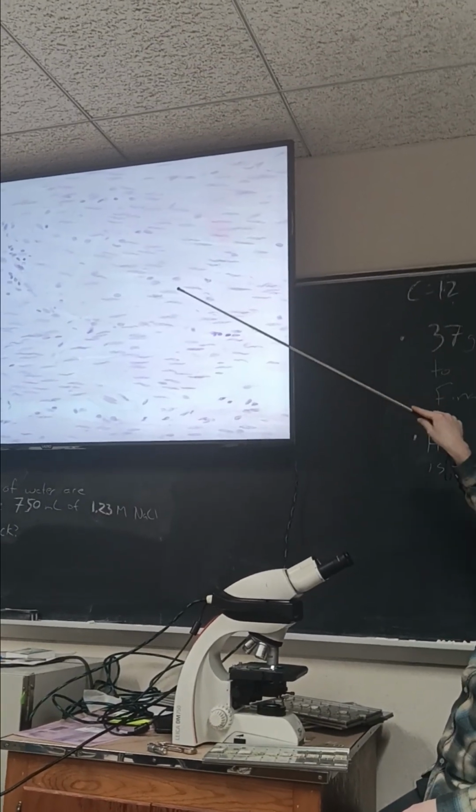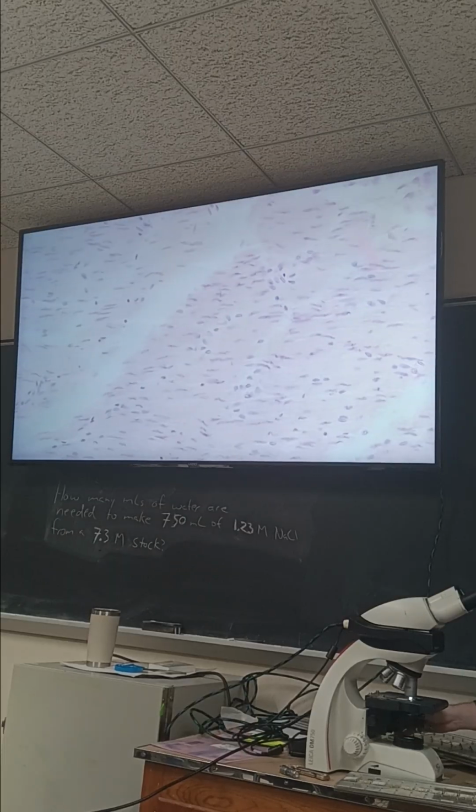Why? Tons of cells. I see some directionality to them, mostly because of the cells, honestly, because I can kind of tell they're like fish swimming left to right. But tons of cells. It can't be a connective tissue for that reason. It's not epithelium. That's a little bit tougher of a discussion, I guess. If it were epithelium, the only one that it could be is stratified squamous, and the only place we find that is the skin and then the vaginal mucosa. And it won't look this way, so you just have to compare that for yourself. There's still too much space between the cells for this to be epithelium, is what I see.